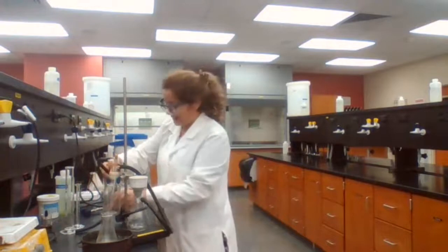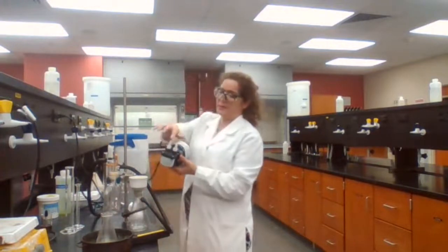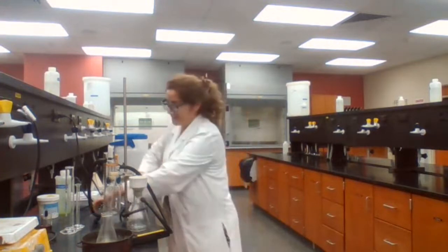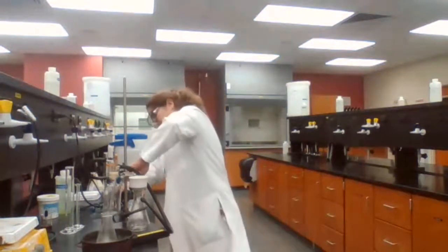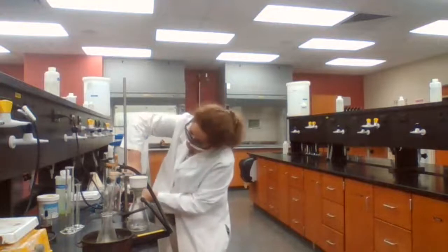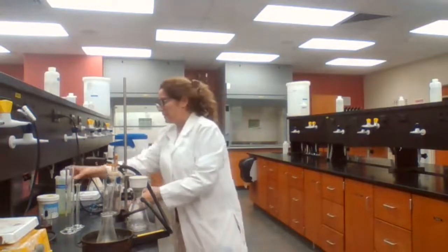Attach the vacuum to the vacuum pump. This is the vacuum pump. When I turn it on, it pulls the air and it creates a vacuum. So I attach the vacuum flask to the vacuum pump using a trap. Turn on the vacuum.